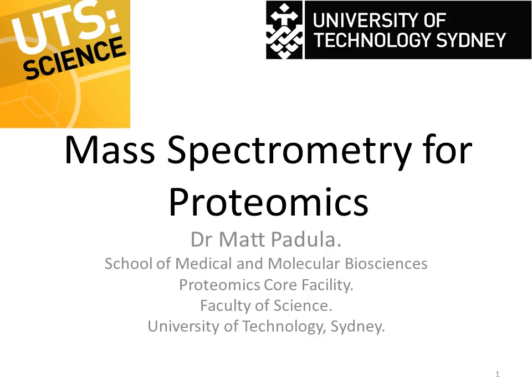In modern proteomics, the mass spectrometer is the key piece of instrumentation that allows the global analysis of complex proteomes to happen in a reasonable time frame. This presentation is all about how mass spectrometers actually work, because you need to understand how an instrument generates data before you can properly interpret the data.